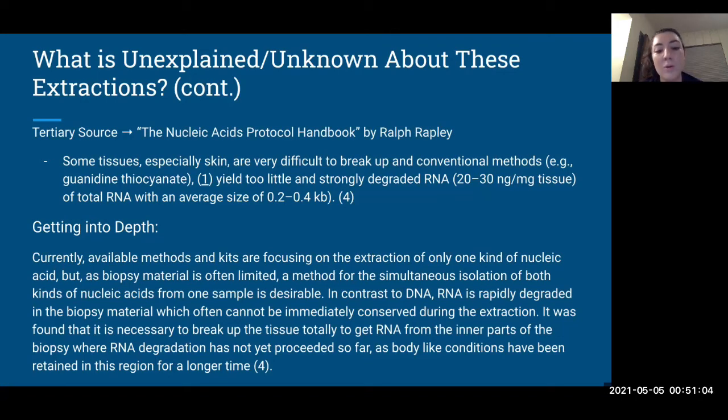In order to conserve it, we have to break up the tissue entirely to get the RNA from the inner parts of the biopsy where the RNA degradation has not yet proceeded so far. So going back to that bullet point up top, it can be very difficult to break these tissues, knowing that RNA is very fragile, and we have to be aware of that.